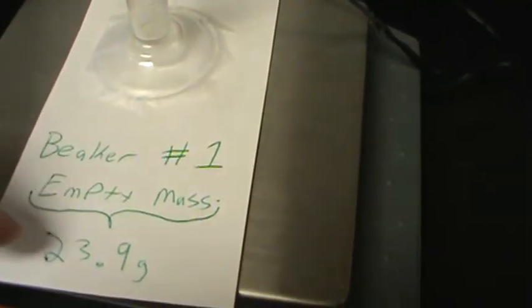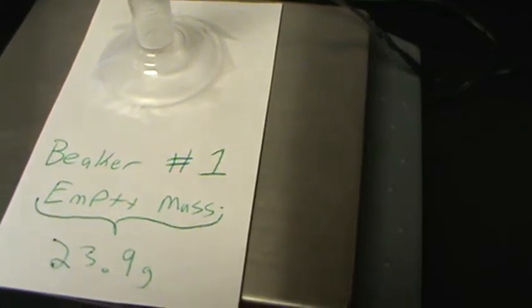So are you clever enough to say, hey, if I need the mass of only the liquid, and I know that empty, it had a mass of 23.9, what do I do to figure it out? All right, that's on you.